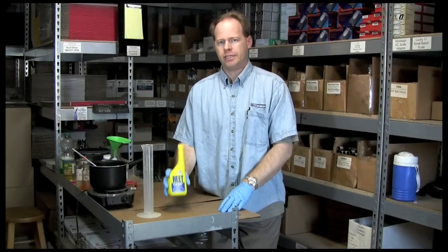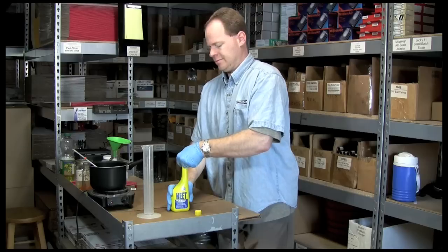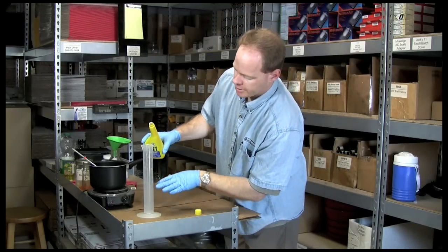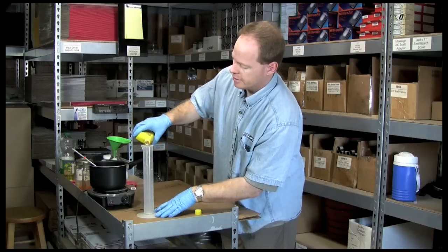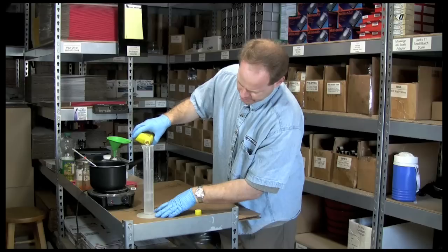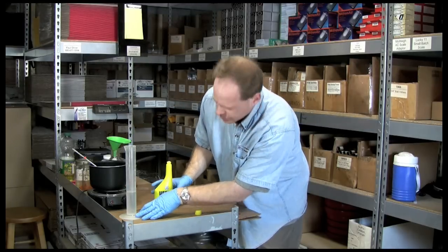The next step is to measure out some methanol. This is a brand new bottle — it's sealed, which is what you want to use. So we're going to now measure out 100 milliliters of methanol, getting right to our 100 milliliter mark.